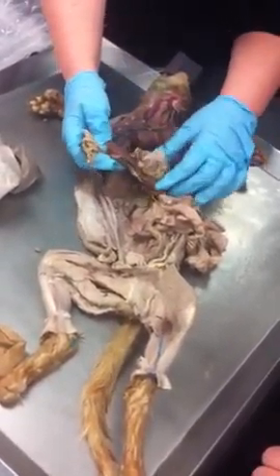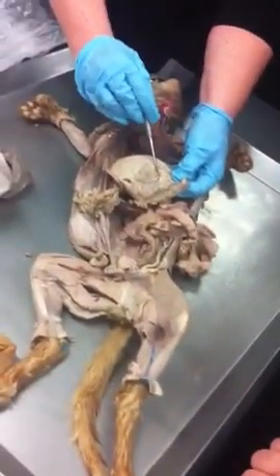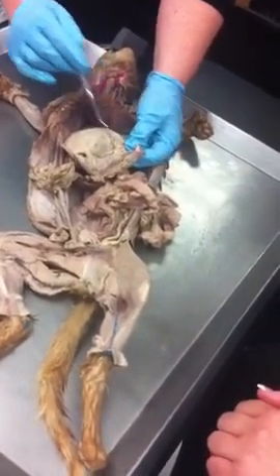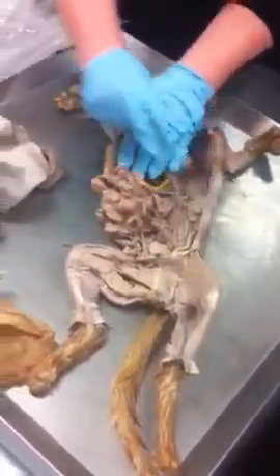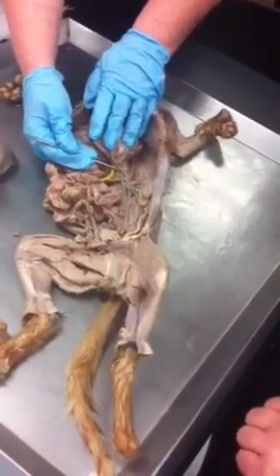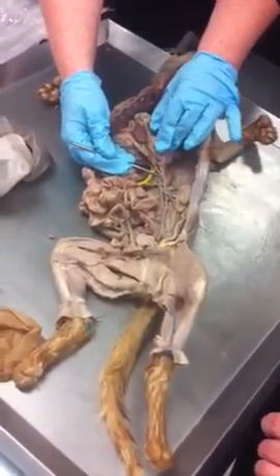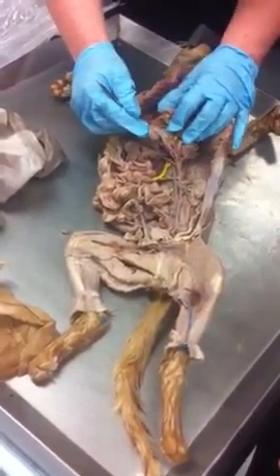I think we went over all the stomach stuff pretty well, but remember the sphincters and the rugae. So which sphincter is this one? Cardiac. Yeah, and then these are the rugae here. What's this first unpaired artery, and what's it coming off of? So abdominal aorta right there.